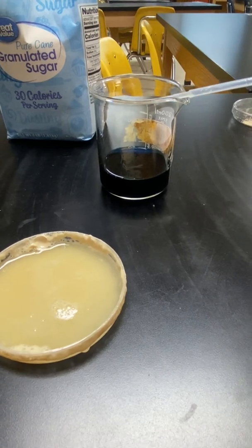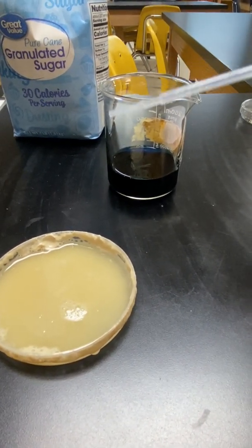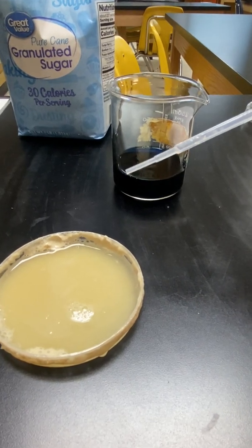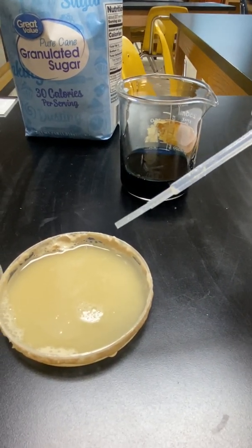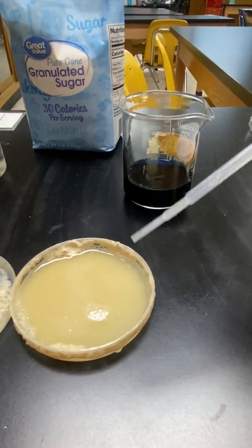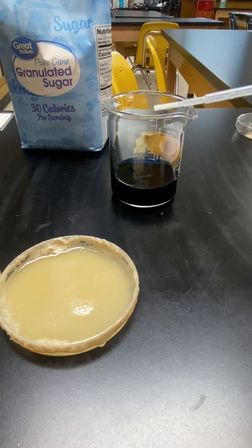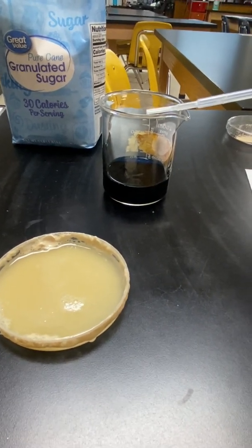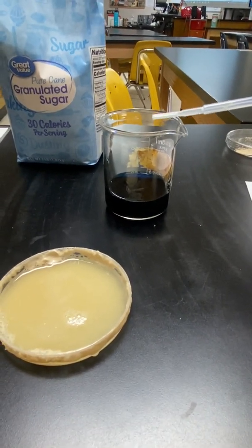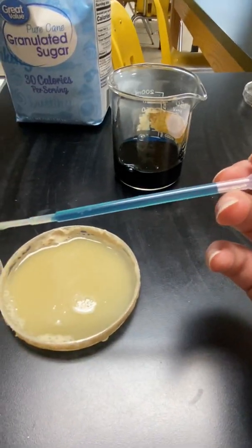Carbon dioxide dissolved in water will become acidic. So carbon dioxide makes water acidic. So if it turns yellow, that means that carbon dioxide is present and it's acidic. If it remains blue, that means the pH is higher than 7.6, so it's more basic if it stays blue. Look right here, the chemical is blue.